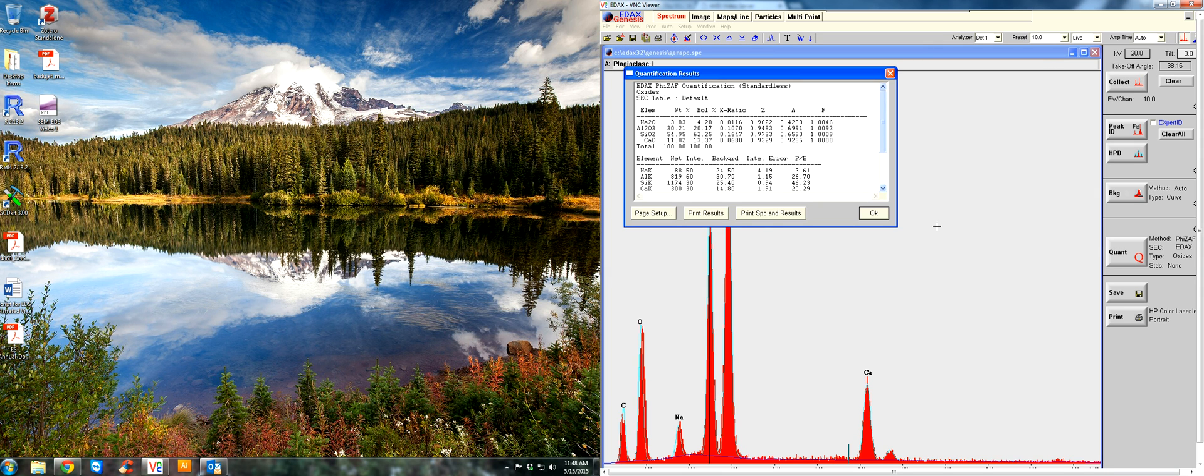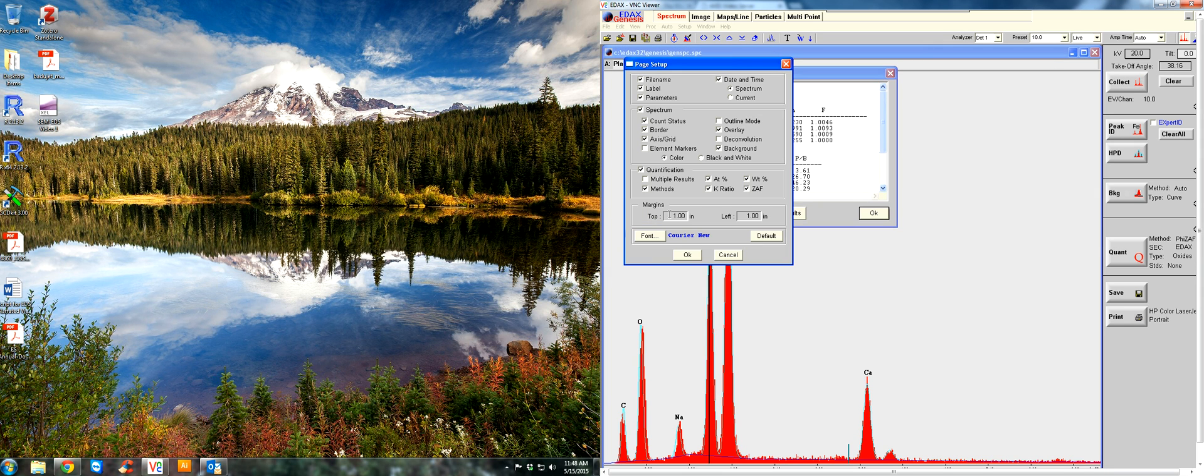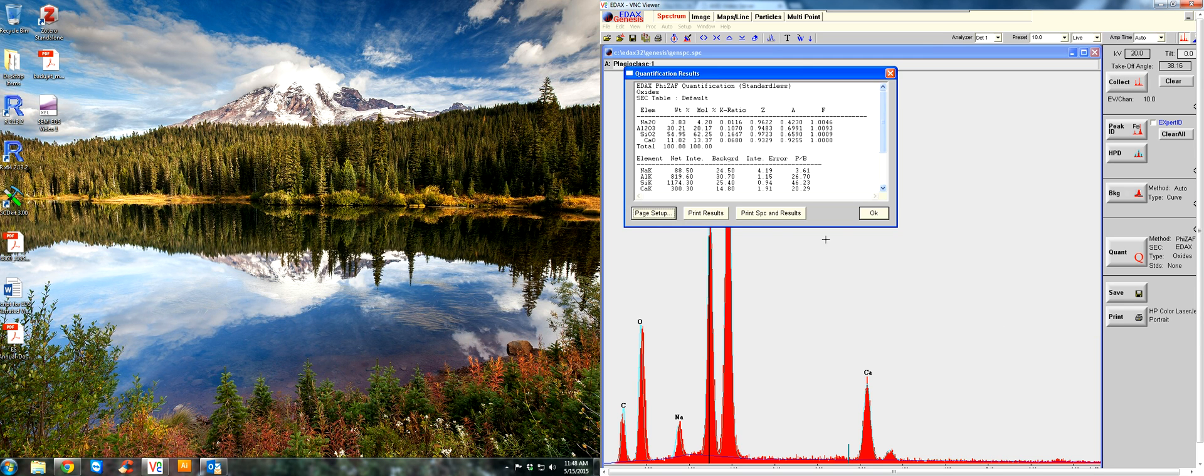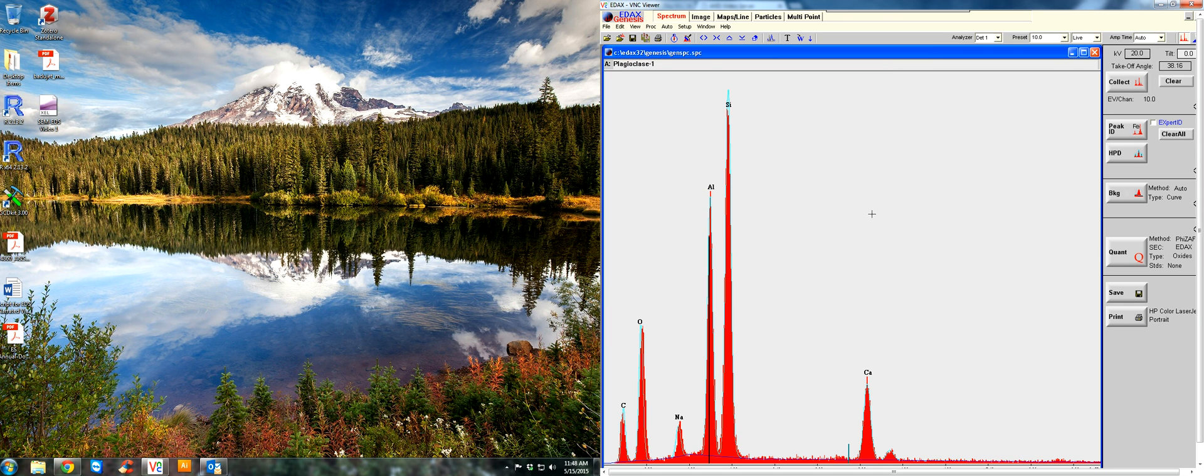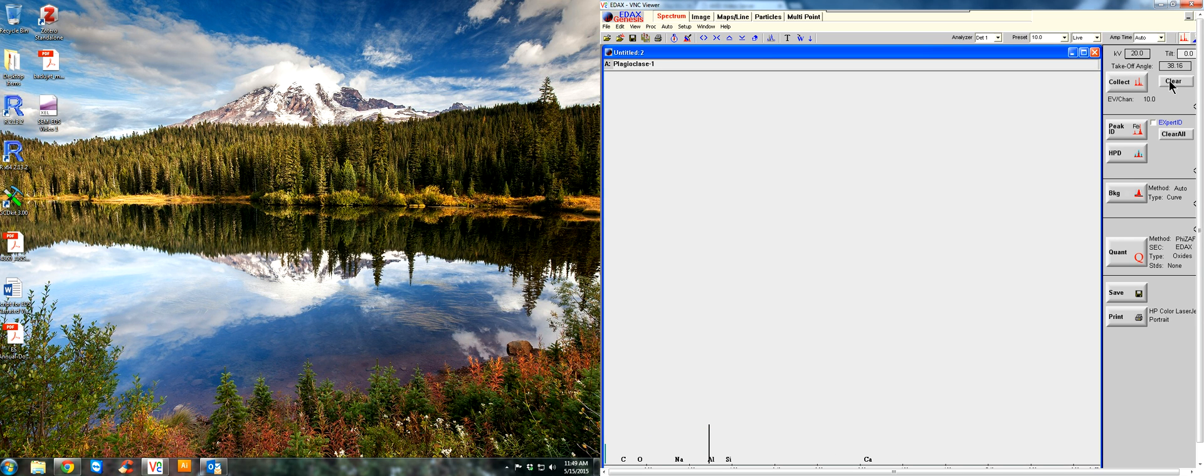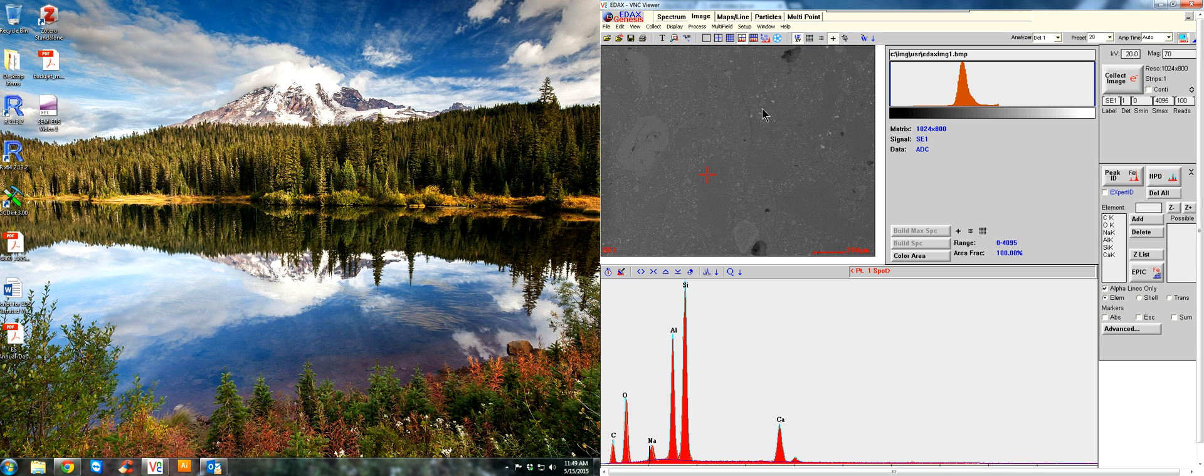You can edit the output for your raw data with different options here. And you can print the results as well. So that's pretty much it for the spectrum analysis. If you want to do another point, you can clear your data here, go back to the image tab, and find yourself another point. Maybe analyze this phase. And that's it. Thanks.